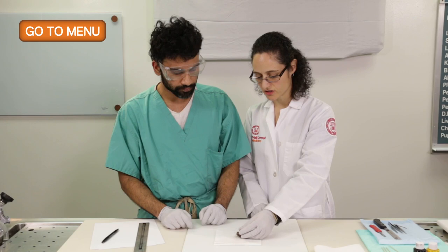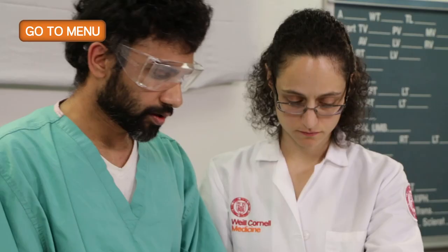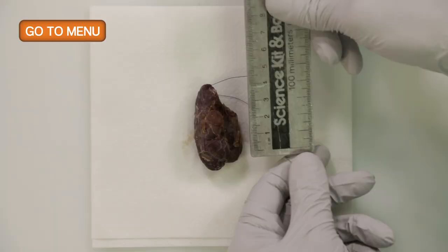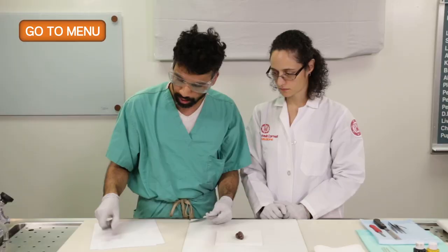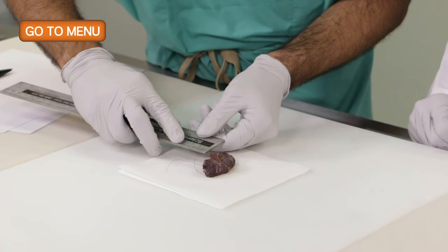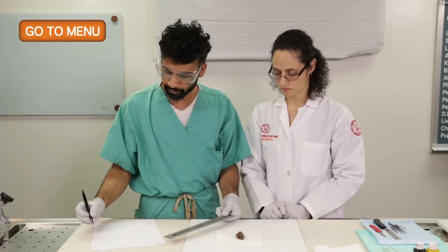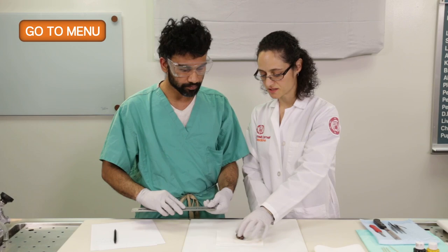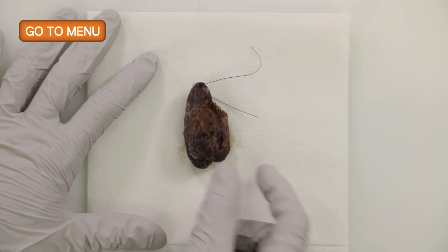What other part of the specimen do we have? The other part you have to always keep in mind is the cauterized isthmus margin. So you want to measure that as well. The isthmus is 2.1 centimeters long, and about 0.4 centimeters wide. The amount of isthmus may vary on a hemithyroidectomy specimen, and may be a small portion of it or a much larger portion.